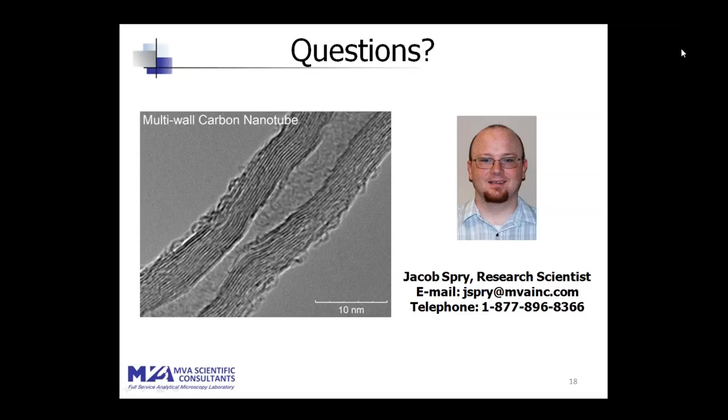We have one that came up. The EDS can tell us exactly the type of elements, but what is the accuracy of the atomic ratio of these elements from the EDS data? Can we trust the EDS? I always like to say that with the EDS, as far as atomic ratios are concerned, I always considered it a semi-quantitative method. In a lot of materials that I look at, there can be local changes in the chemistry anyway.